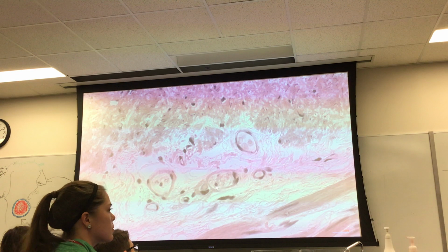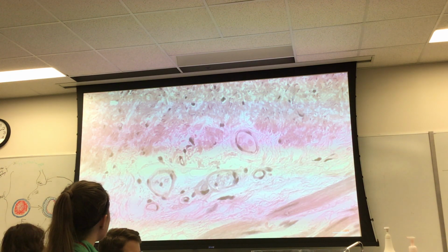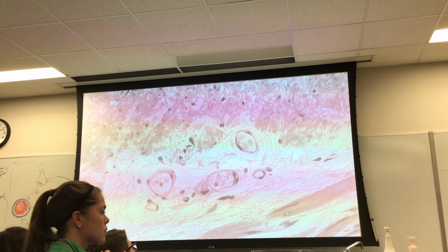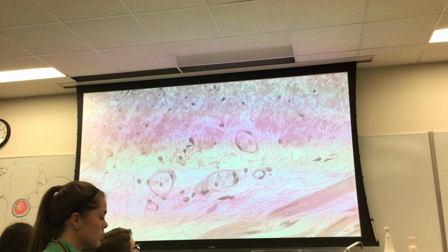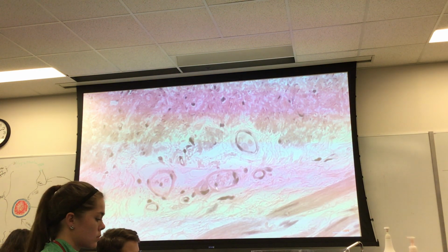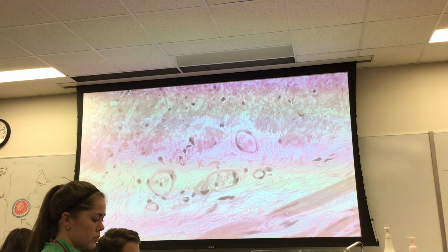Hopefully you can see this. So I guess the relevant question is, is that a blood vessel? And the answer is no, it's not. So these are myelinated axons. So now, with that heightened appreciation, what's the name of that cell? That's a Schwann cell.